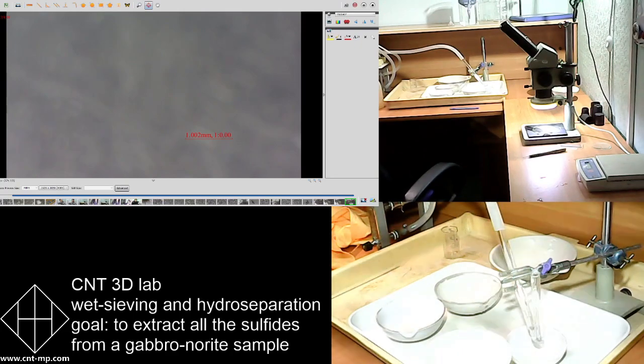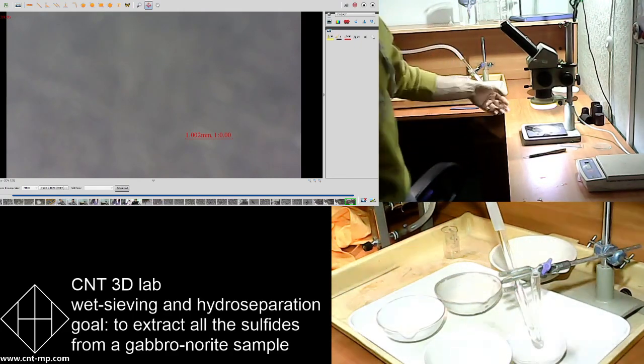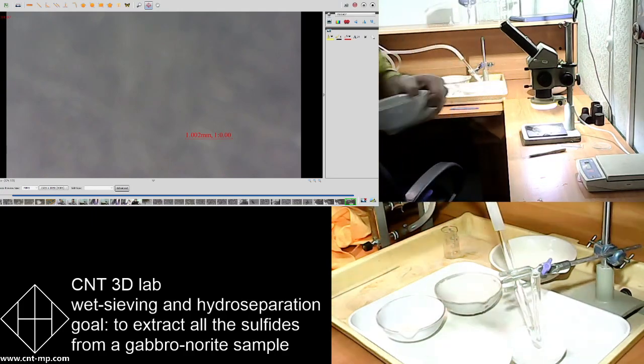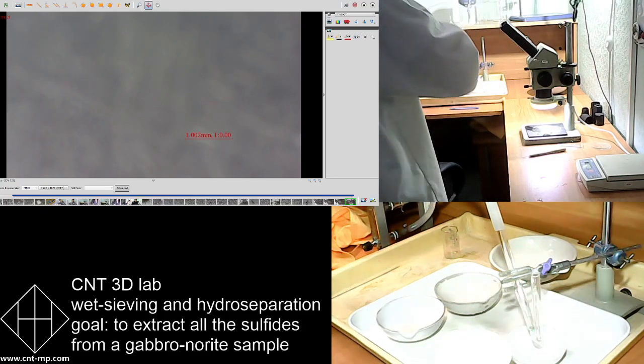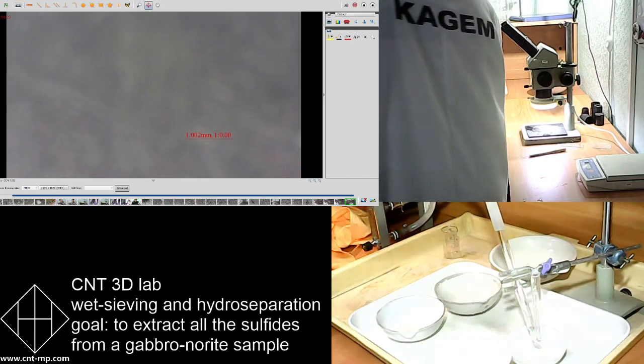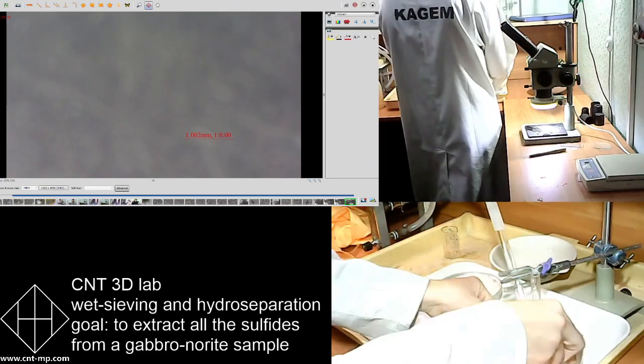So whenever you have a subsequent amount of fraction that can fit in small GST after certain amounts of sessions with long GST, then you can switch from long GST to the short GST, and so it will be just enough amount of space for that amount of preliminary concentrate to feed the shorter glass separation tube. As easy as that.